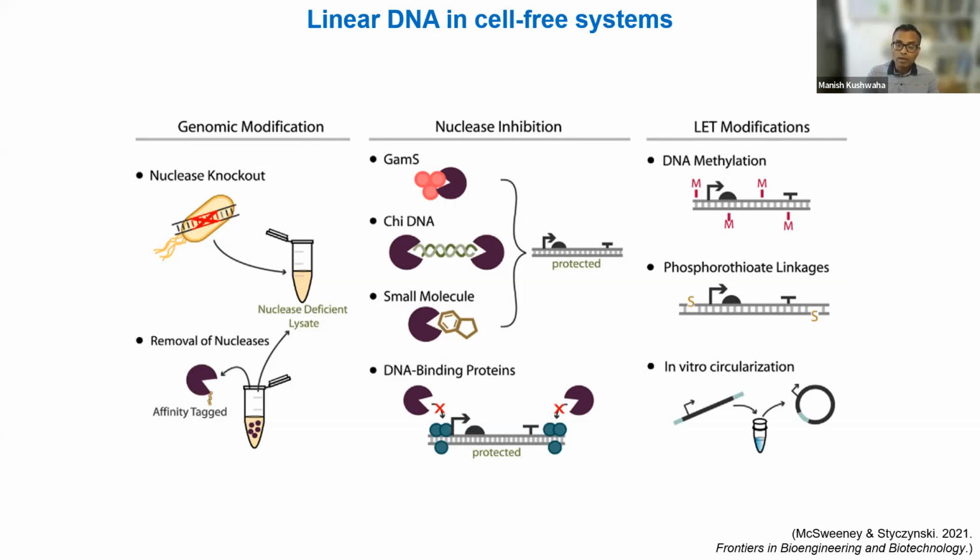Now, of course, this had been done before, as I already told you, but it had been done in strains that were not the most productive strains. So it was originally done in E. coli A19, and these strains at least are not, I don't know if they are in a repository. I tried looking for them, I could not find them.